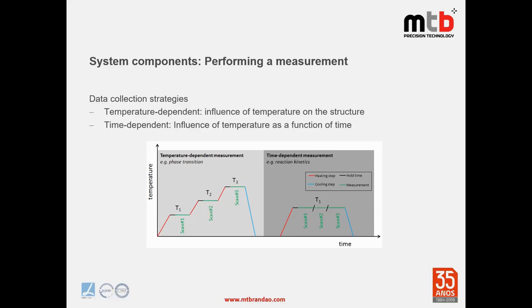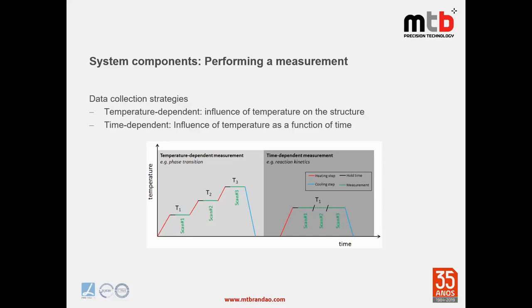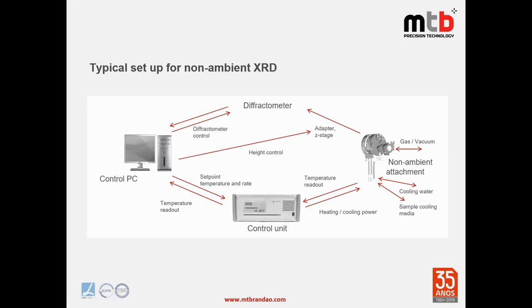Time-dependent measurements follow similar principles to temperature-dependent measurements. A typical setup for non-ambient X-ray diffraction contains not only the diffractometer and non-ambient attachment, but also a control unit and control PC, gas lines, vacuum equipment, and cooling water lines. All components should be connected with optimal automated remote control. The most important variable is temperature, since it has a major impact on the crystal structure of many materials.